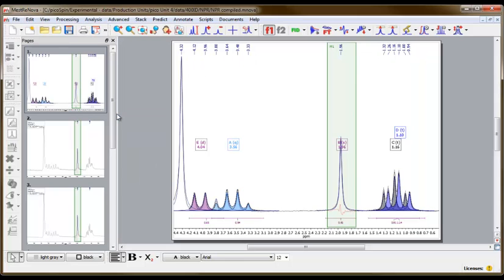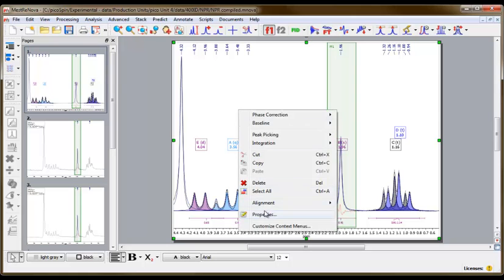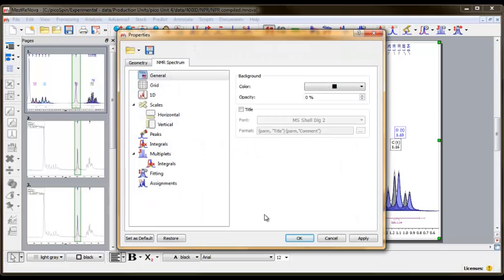Right-click the image in the spectrum workspace and select Properties. A dialog box will appear. In general, under the NMR Spectrum tab, you'll see a section labeled Title.